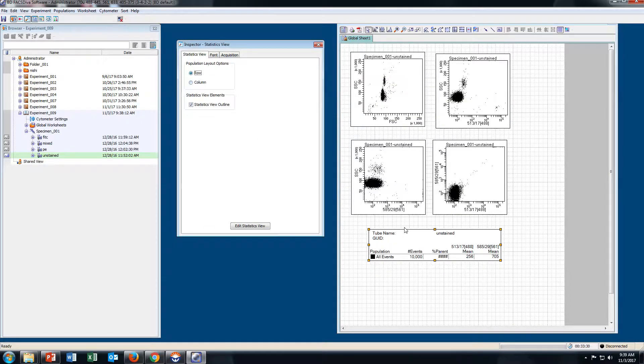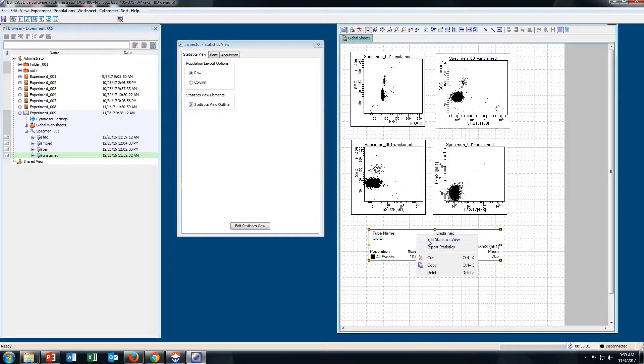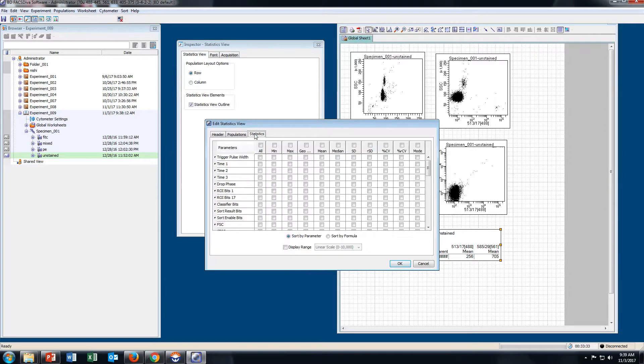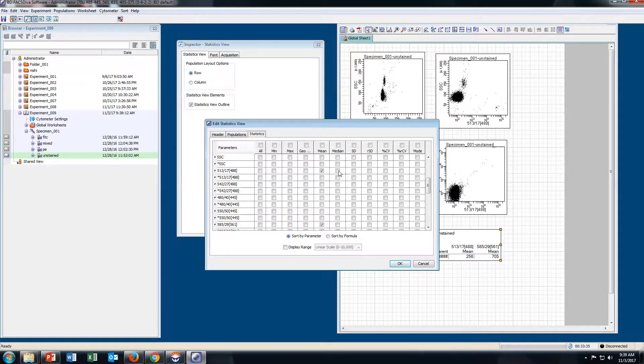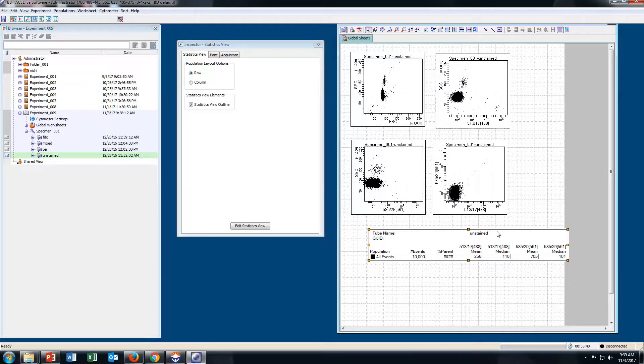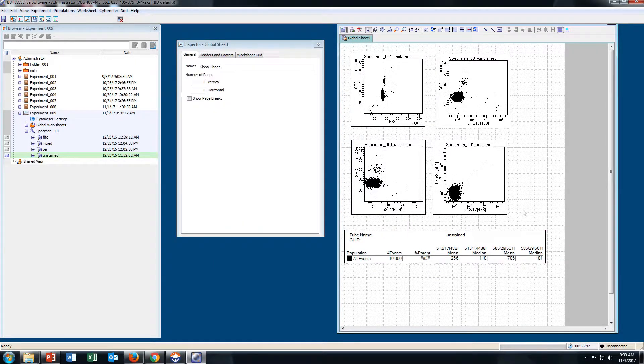I will take it as a row. Then Edit Statistic View. Go to Statistics and select Median for both parameters.